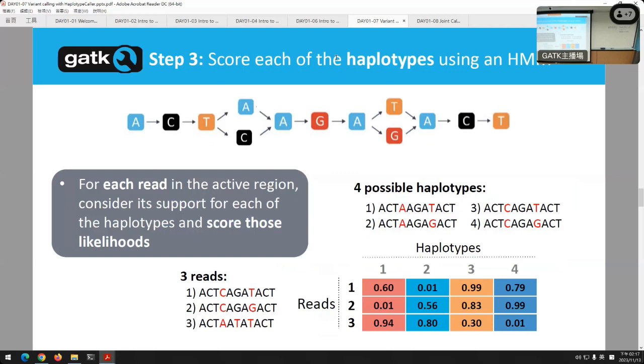Notice the red. On number 1, I have an A and a T. That's the reference. Okay? These are the possible ways I can go through the graph from the start to the finish. There's 4 ways I can go. Top and top, top and down. That's 2. I can go down and up, and then down and down. There's 4 ways. Now, that doesn't mean every possible haplotype is seen in the reads. But that's the 4 possibilities.